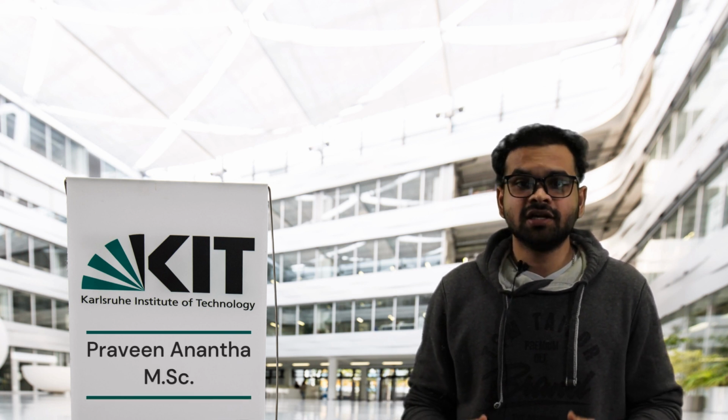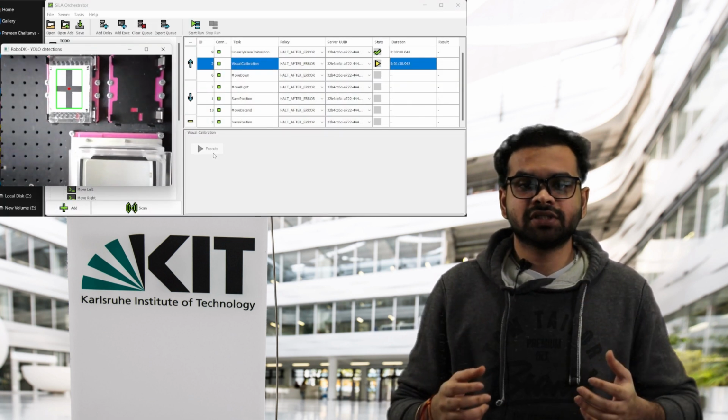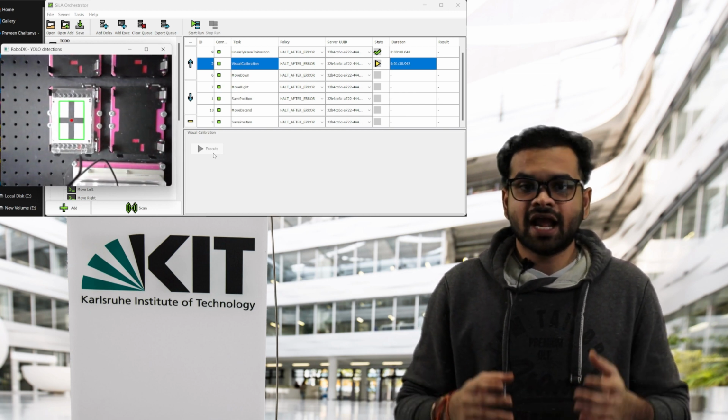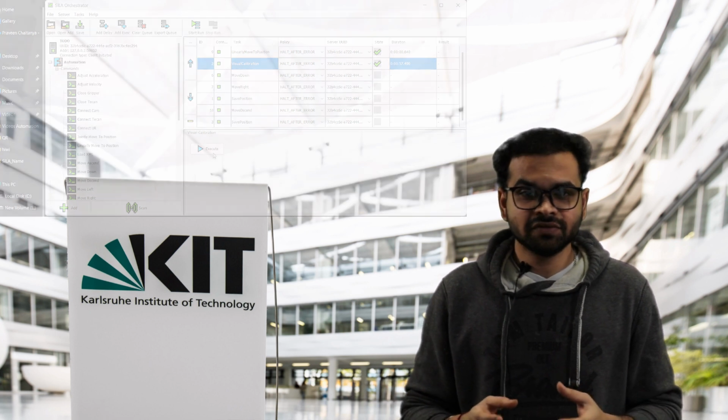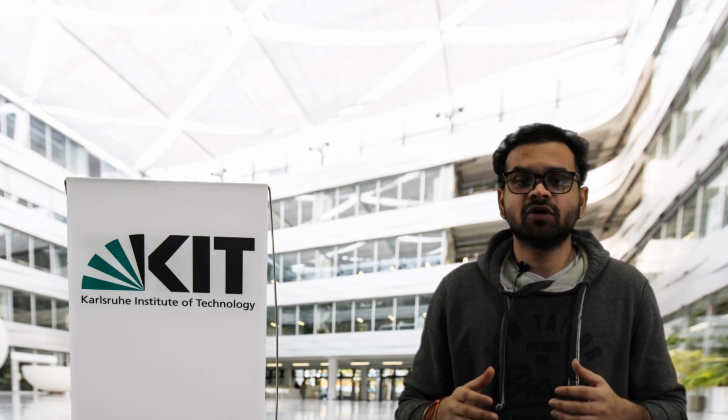Before automation is done, every worksite should be calibrated. For calibration, a simple camera is mounted onto a robot arm. The camera uses machine learning and AI algorithms to know the positions of the sample holders, and the individual sample holders are distinguished using a small QR code. Once the workflow is calibrated, the scientists can work more productively.